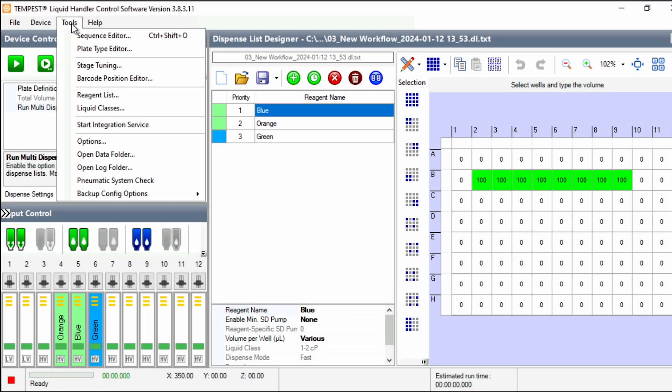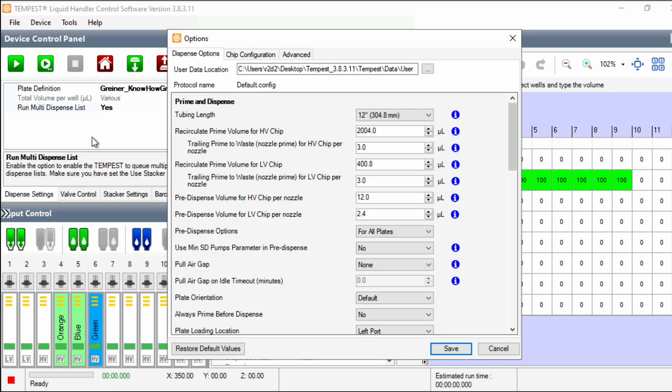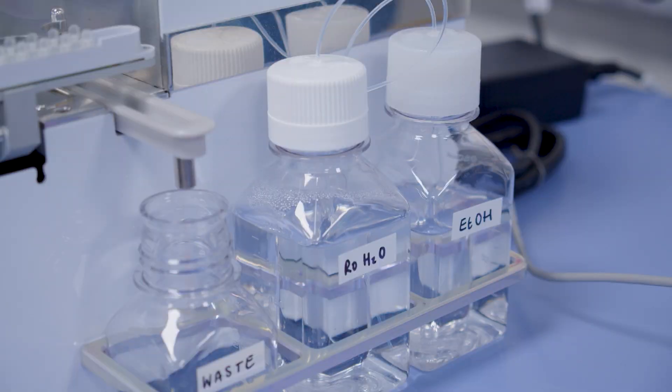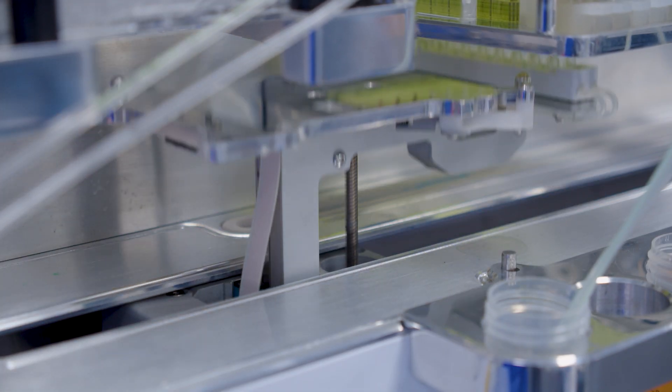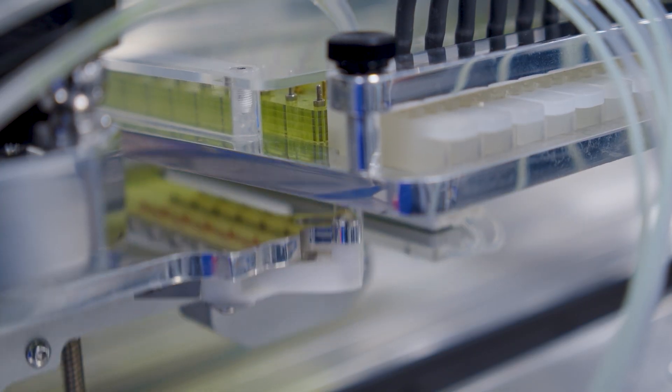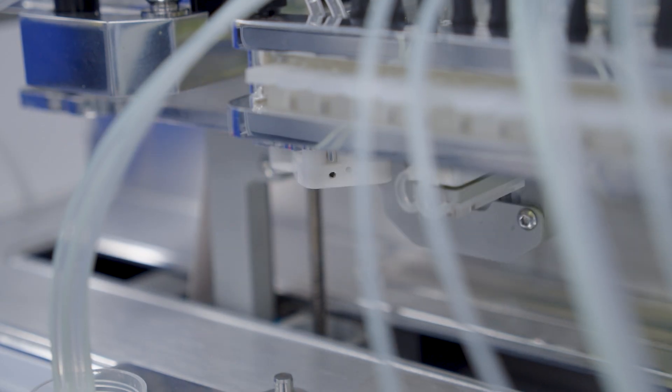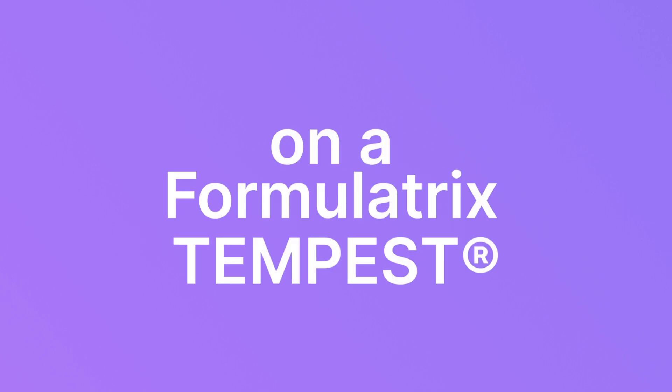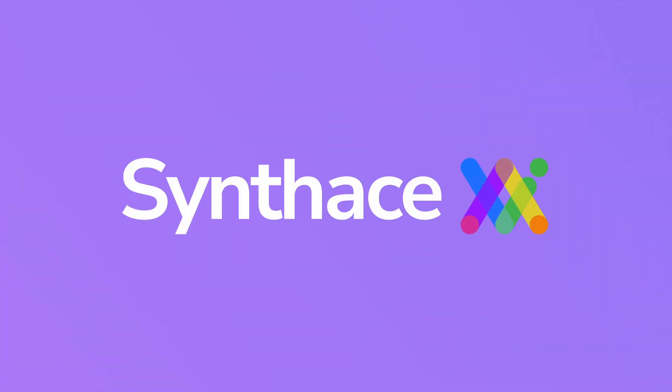The way the chips are washed is configurable, but in our case, we've set up a water and a 70% ethanol wash station and it will wash through first with water, then with ethanol and once more with water. And that's how you run a workflow on a Formulatrix Tempest using Synthase.